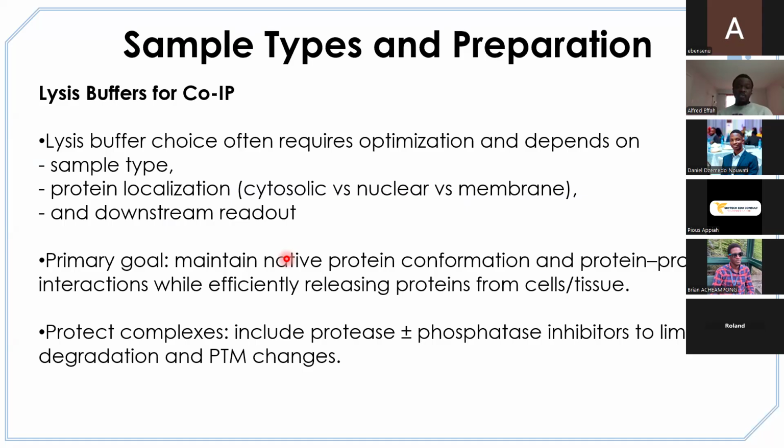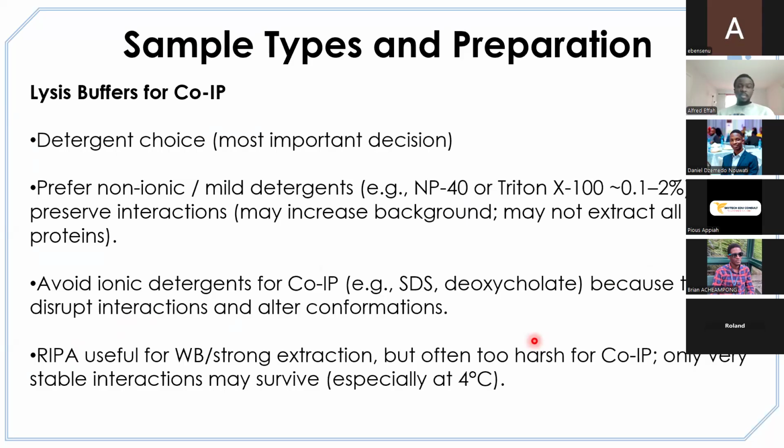Okay. Now, you know, proteins too can be degraded by proteases. So as part of your lysis buffer, make sure to include protease inhibitors, which will prevent degradation of your proteins. Now, the common lysis buffer that I use, we have NP40, Triton X. Like I mentioned, depending on your protocol, look for a protocol that has been used and optimize it, make sure it works well for your studies. But these are some key ones.